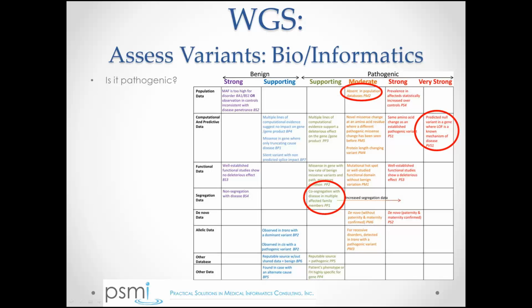And in addition to that, we can point to the specific evidence for pathogenicity. The guidelines examine a lot of different types of evidence in order to determine pathogenicity. And then there's a scoring mechanism, and there's a calculator that can be used.